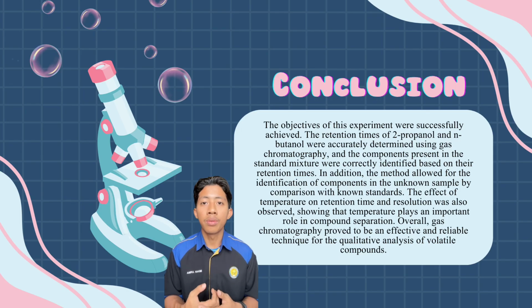We also observed that temperature has an effect on retention time and resolution, which shows that temperature plays an important role in compound separation. Overall, this experiment shows that gas chromatography is an effective and reliable technique for the qualitative analysis of volatile compounds. That's all.